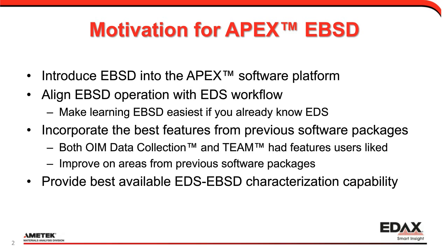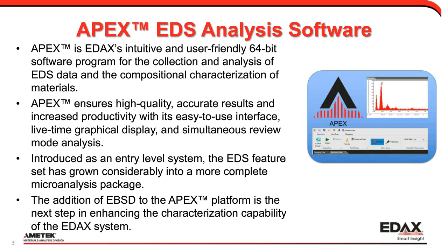So just to give a brief background on APEX and APEX EDS, this was a software platform that was designed for 64-bit architecture to take advantage of the 64-bit processors and operating systems. This allows us to handle larger data sets better, allows us to use Windows 10 more easily. And as we've done that, we've tried to build a very intuitive and user-friendly interface. We've really tried to emphasize having high-quality, accurate data, giving good feedback during that, and to make analysis easy.